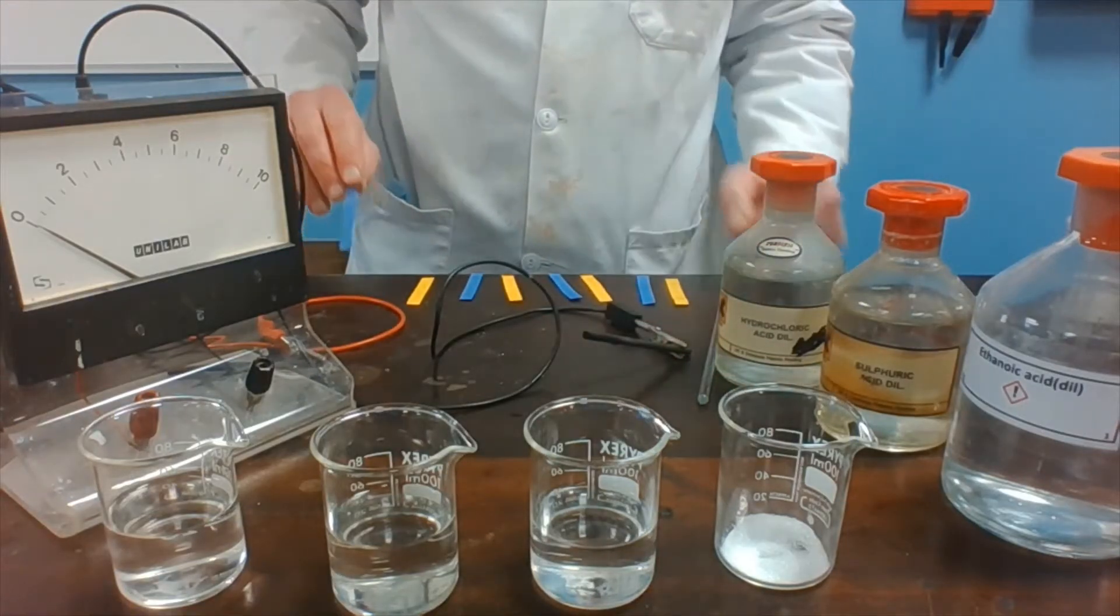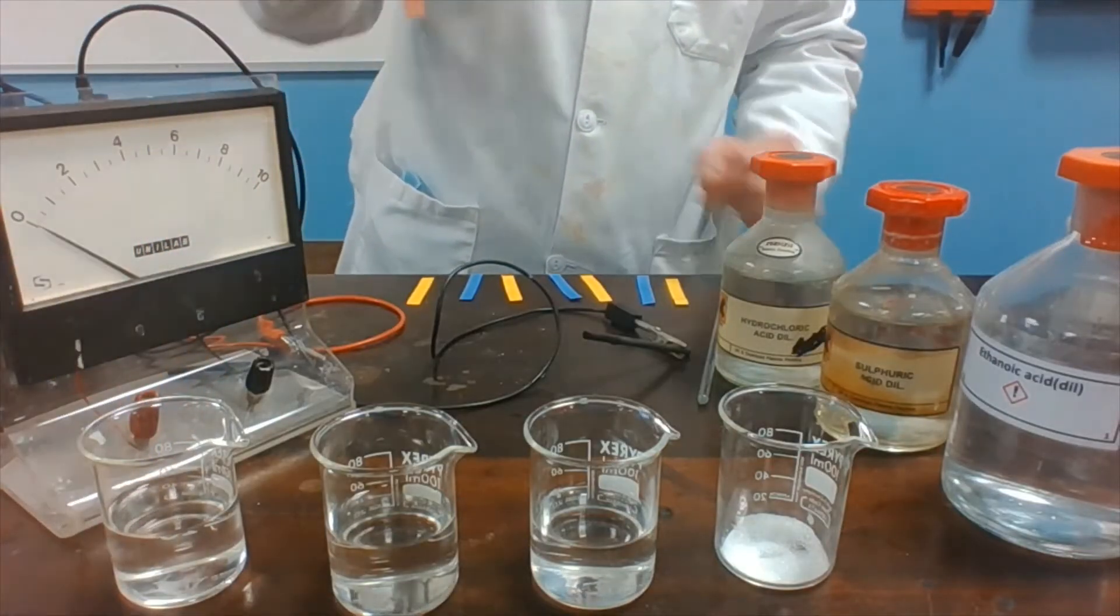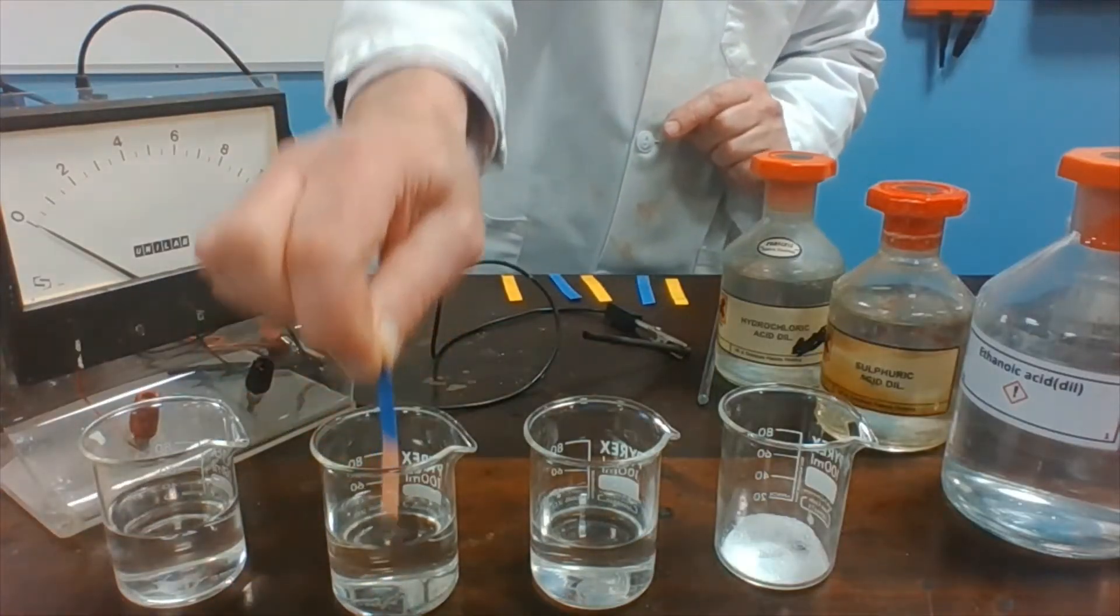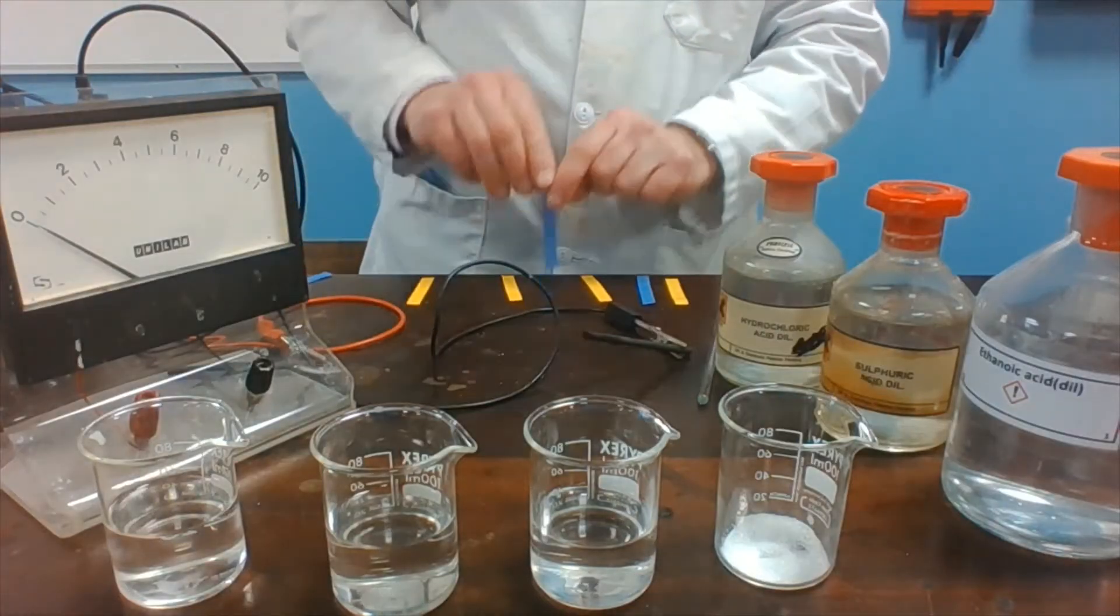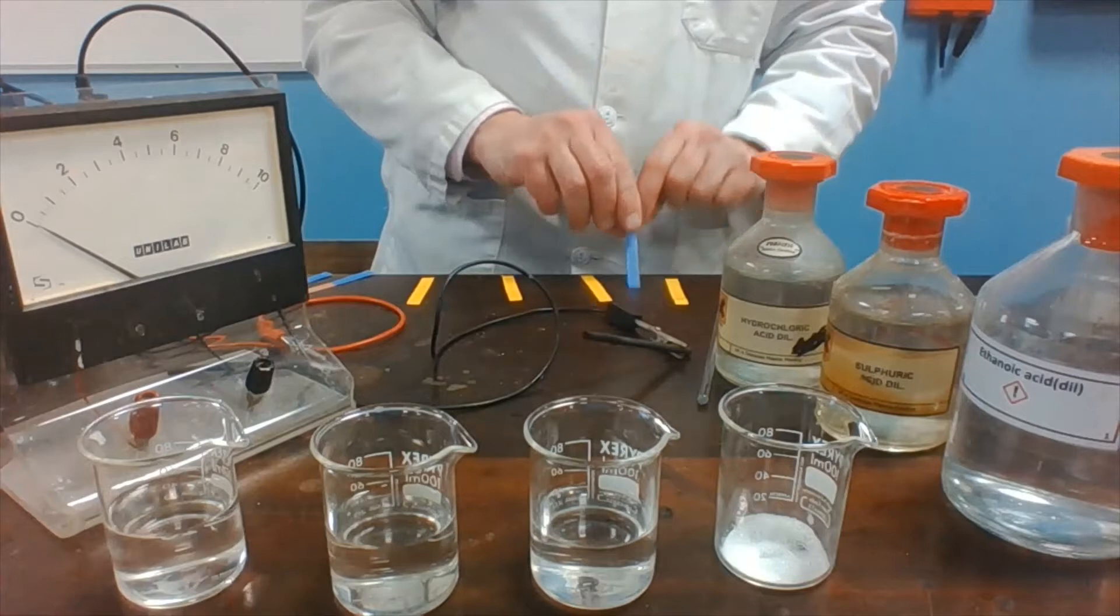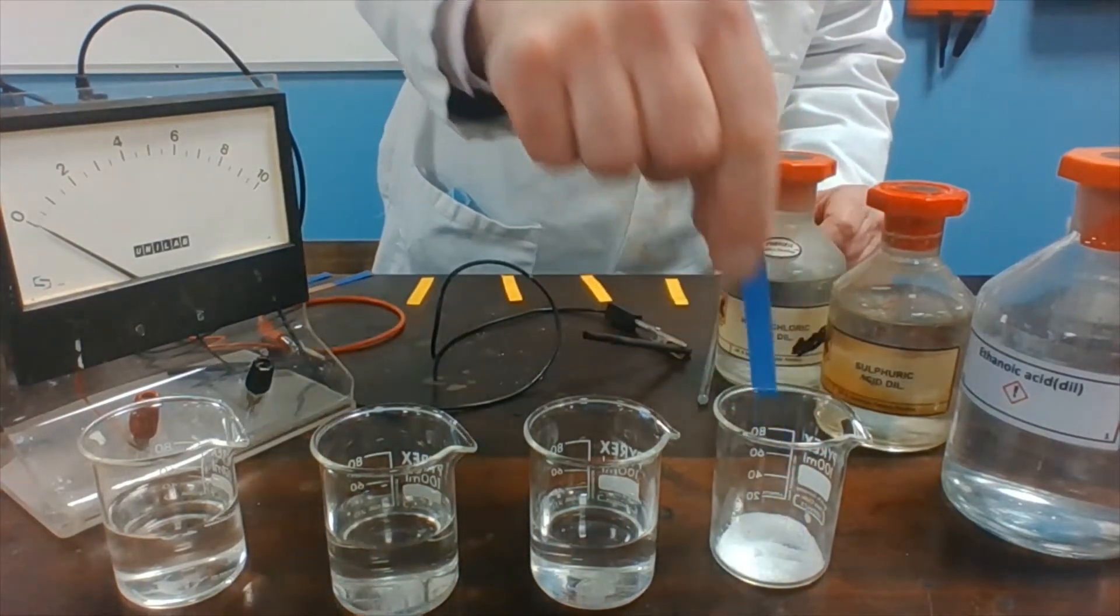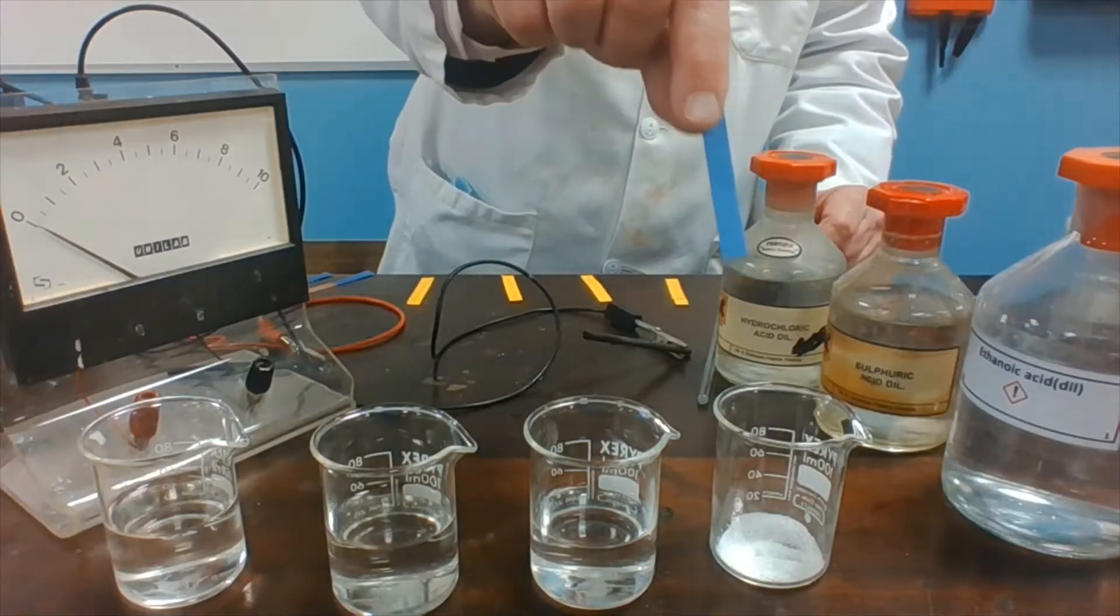If I test these solutions with blue litmus paper, it turns red. The sulfuric acid turns red. The ethanoic acid turns red. The citric acid has no effect on the blue litmus paper.